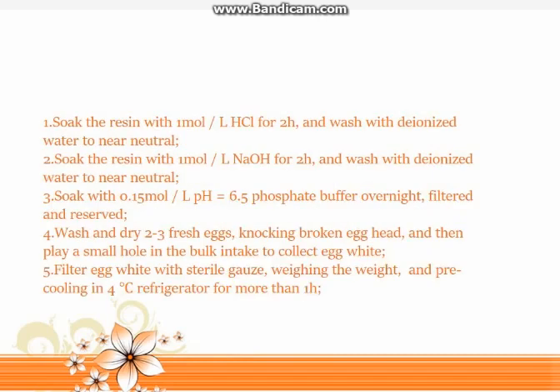Step 1: Soak the resin with 1 mol/L HCl for 2 hours, then wash with deionized water to near neutral. Step 2: Soak the resin with 1 mol/L NaOH for 2 hours, then wash with deionized water to near neutral. Step 3: Soak with 0.15 mol/L phosphate buffer at pH 6.5 overnight, then filter and reserve.